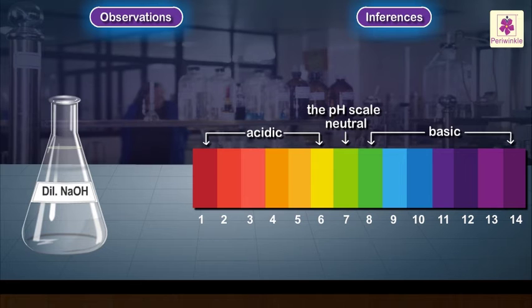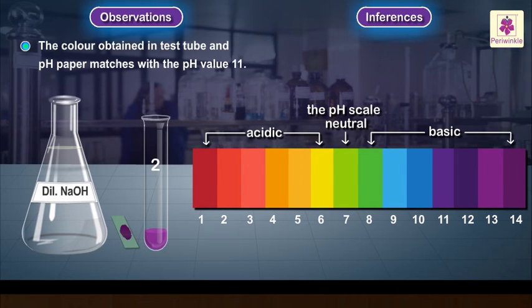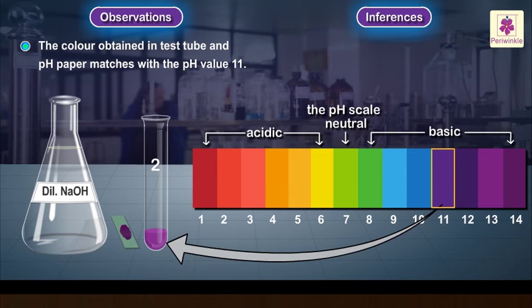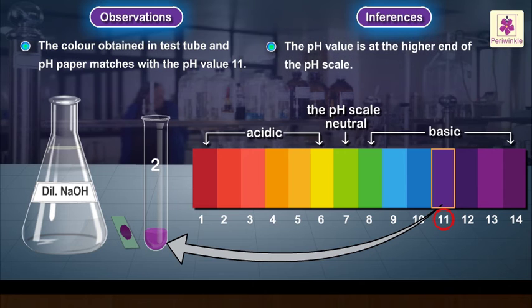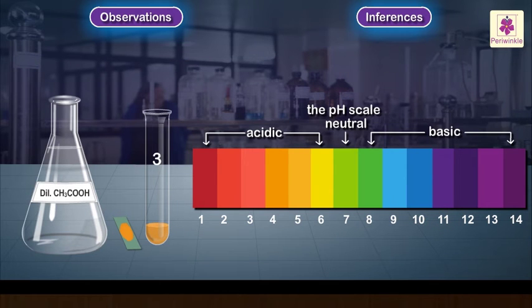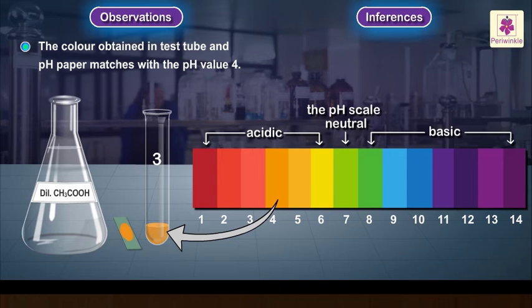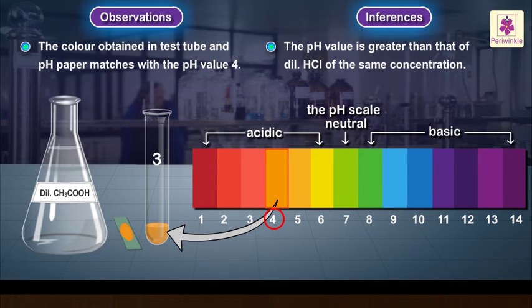Dilute sodium hydroxide solution: the color obtained in test tube and pH paper matches with the pH value 11. The pH value is at the higher end of the pH scale. Dilute ethanoic acid solution: the color obtained in test tube and pH paper matches with the pH value 4. The pH value is greater than that of dilute hydrochloric acid of the same concentration.